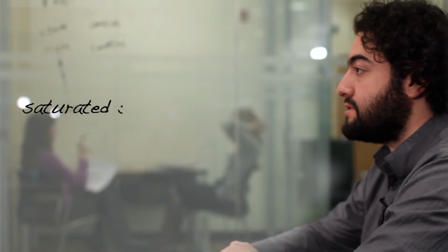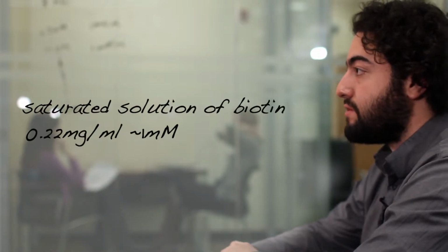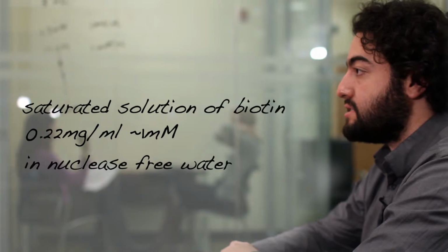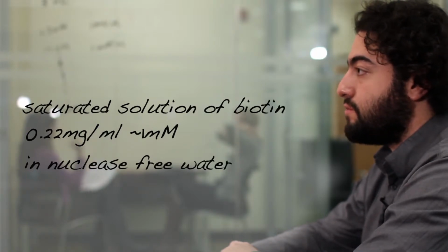To prepare the biotin quencher, you'll want to make a saturated solution of biotin, 0.22 mg per ml, or roughly 1 millimolar, in nuclease-free water. To ensure that the solution is saturated, we recommend having excess powder in the tube. The tube can be vortexed and then centrifuged before each use.